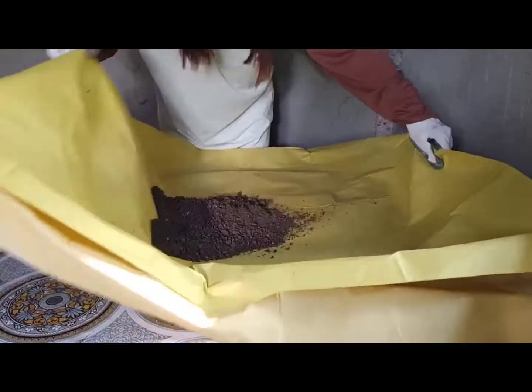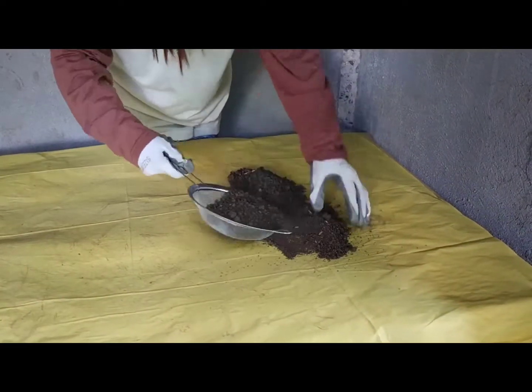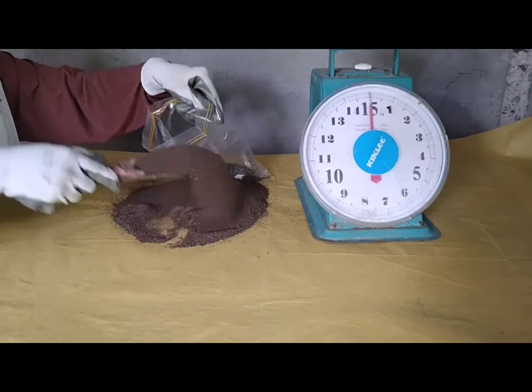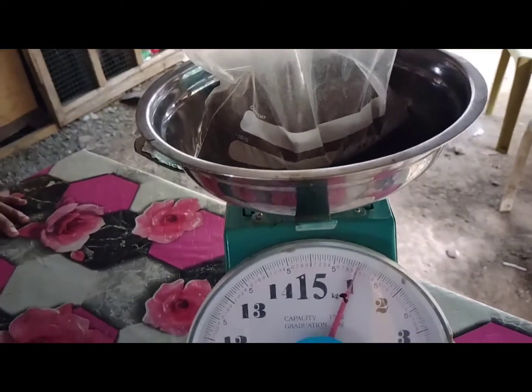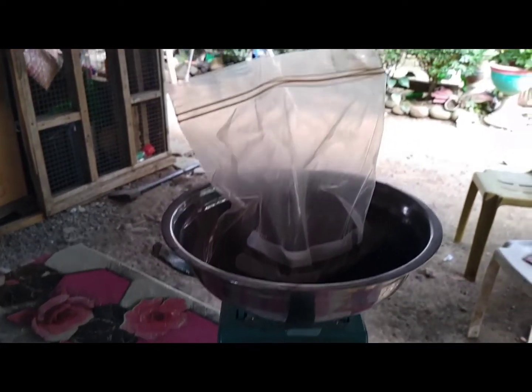Pulverizing. As soon as the sample is air-dried, pulverize the soil with the use of a clean mortar and pestle if available. Otherwise, pulverize the soil with the use of a hardwood, wooden or rubberized tool. And for the packing and labeling. As soon as the sample is sieved, put the soil into a plastic bag. Place the necessary label on top of the soil and tie the plastic bag.